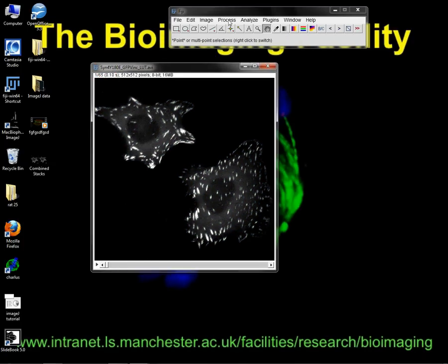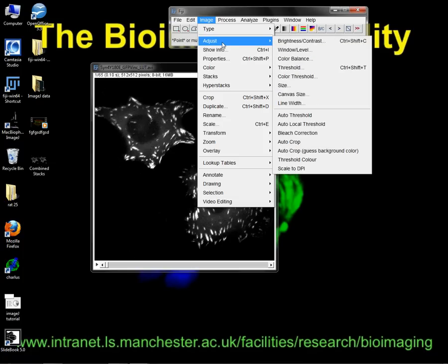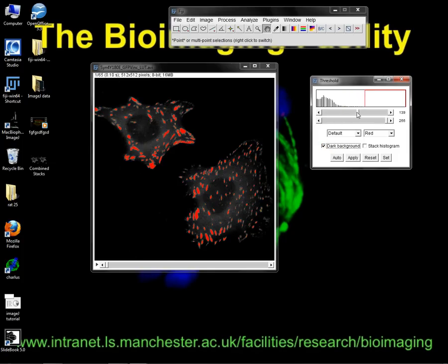So, we need to threshold first of all to decide what it is we want to count. So again, dark background. What do I want to use? Well, all those cells.